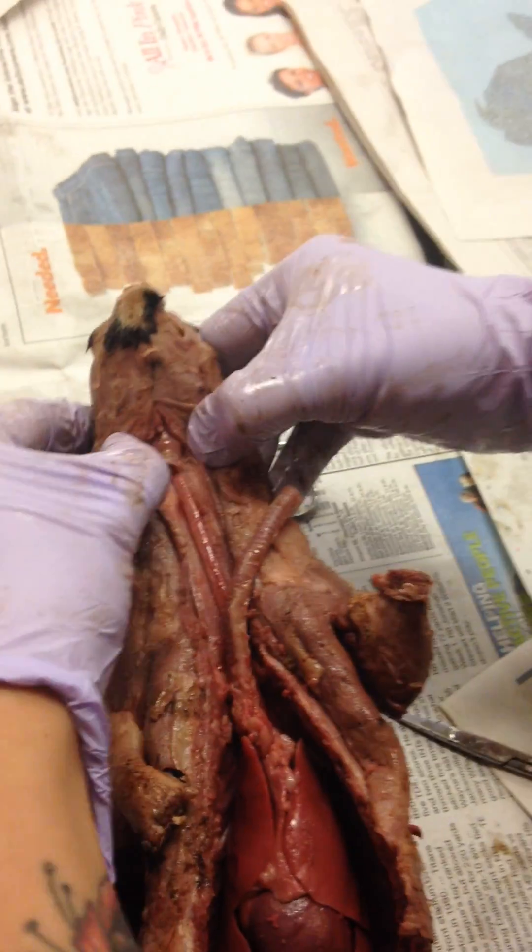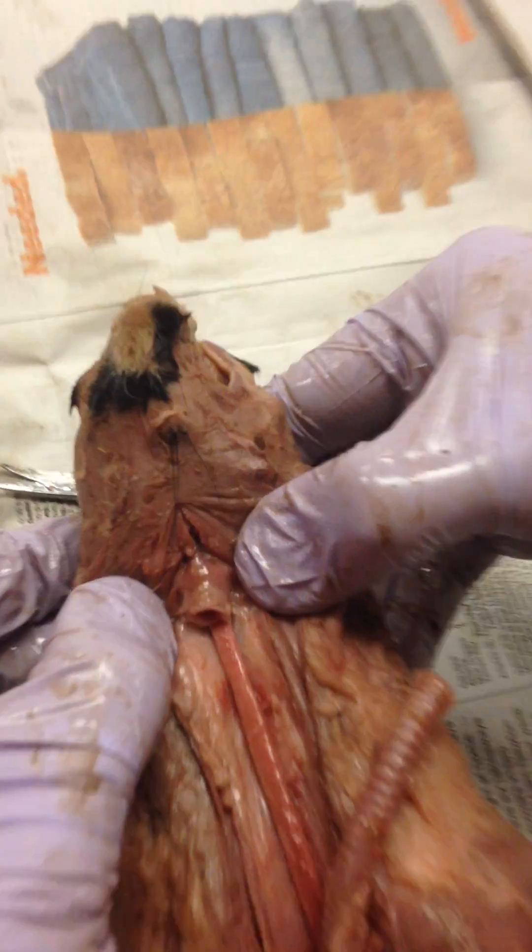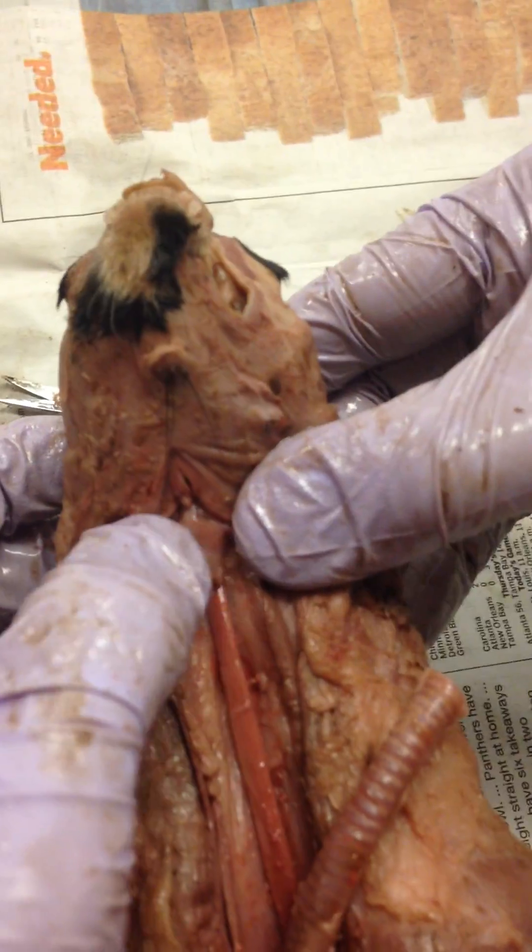I'm going to snip the top of my trachea. I still have my larynx in there and I can tell because I can see a little bit of muscle on top of there. It kind of looks like a little ninja mask.